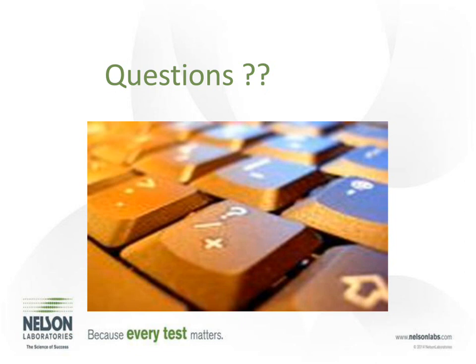You do want to use a quantitative method whenever you can. Regulatory agencies right now are accepting the MEM elution test. And in my opinion, since the cytotox really is a screening test and it is already sensitive, I don't like using the MTT test on all devices because you're increasing that sensitivity. Like I mentioned before, we have not seen a regulatory agency not take the MEM, but there is always that risk because the ISO does recommend a quantitative method.